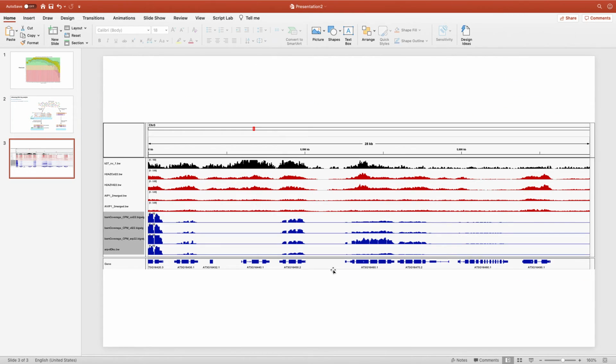So say here I'm just showing you an example. You have a number of samples, and this is a snapshot of IGV, and you can literally see after you normalize it for counts per million. For example, in case of this gene here, I have some ChIP-seq results.